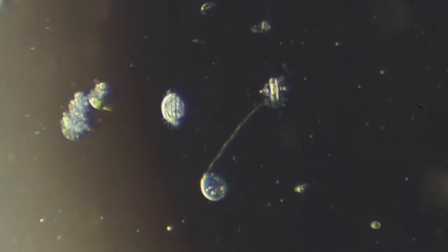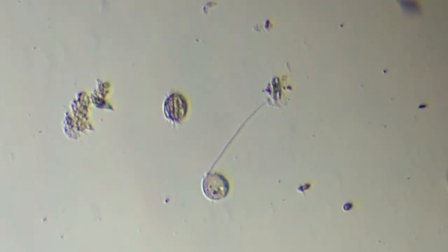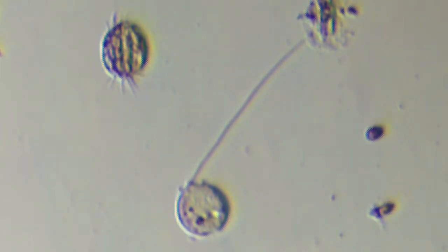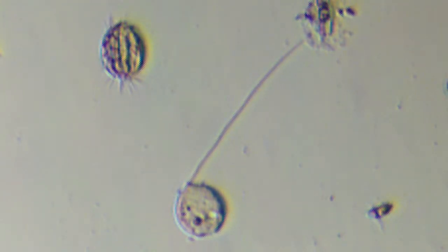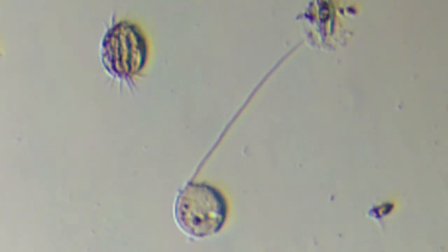But what's cool is you can see... Let me change this to some oblique lighting a tad. You can see it. This one is more spiky. Let me go back in a little closer. See the long cilia that bunch up into a bundle, called cirri, C-I-R-R-I. They're real distinct. And in some of these animals that have cirri, like Euplotes, they can actually walk on them like legs. I've seen them walk on the surface of algae like it's a little beetle, even though it's a single-celled animal. It's just bizarre.